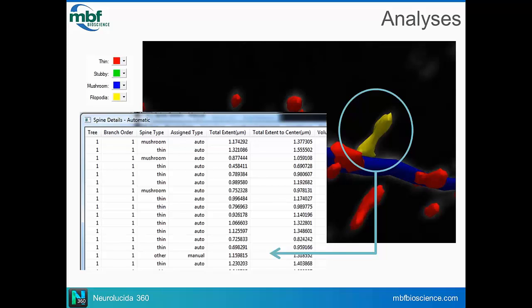The tool that I demonstrated, so this image montage that I started off with, I showed you the maximum intensity projection so that you could see the full extent of the image data within those stacks. But the algorithms themselves actually work in the 3-dimensional space. So even though we're viewing the maximum intensity projection, all the algorithms are working with the entirety of the image data. And that's true also for all the tracing algorithms too. So the spine detection as well as the branch tracing too.